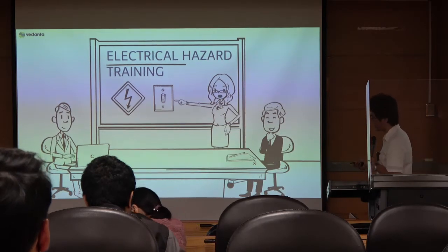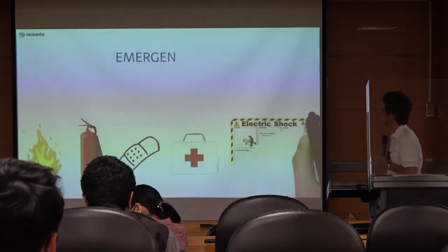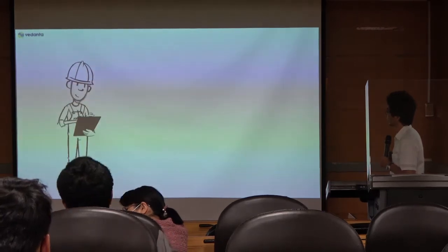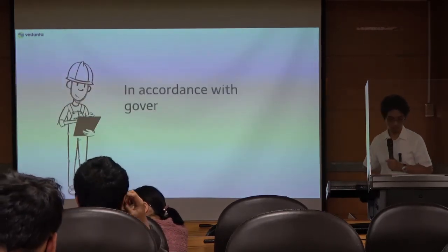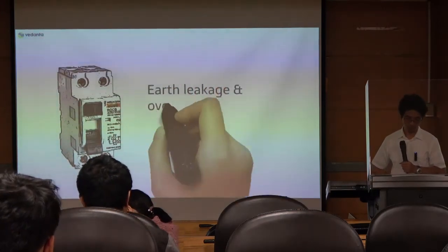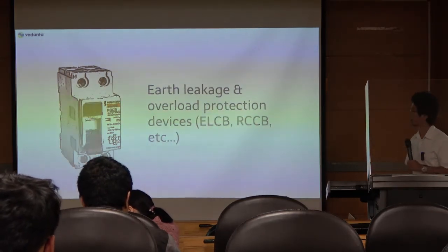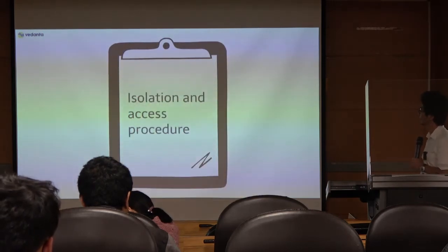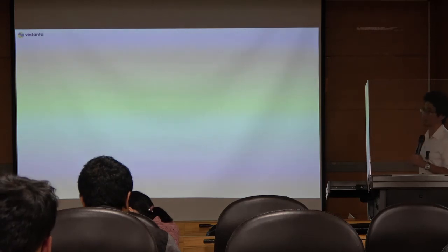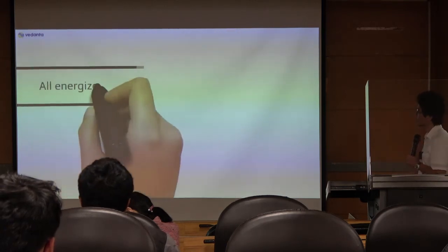This video is usually for the workers of the electricity. Yeah, if you install equipment, cut off the electricity first.